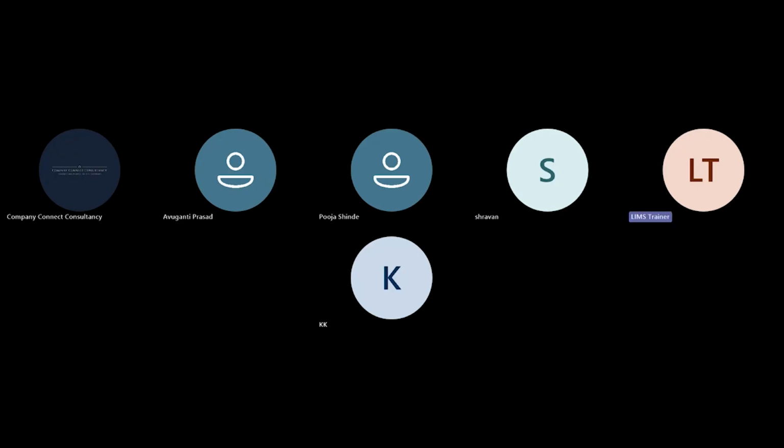Do you have any knowledge about LIMS, or have you worked on LIMS as an end user before? Sir, yes, in Dr. Reddy's, my previous organization, I worked in an implementation role, in master data creation. Various departments in QC, one by one, got warning letters from the US FDA for the manual entries.